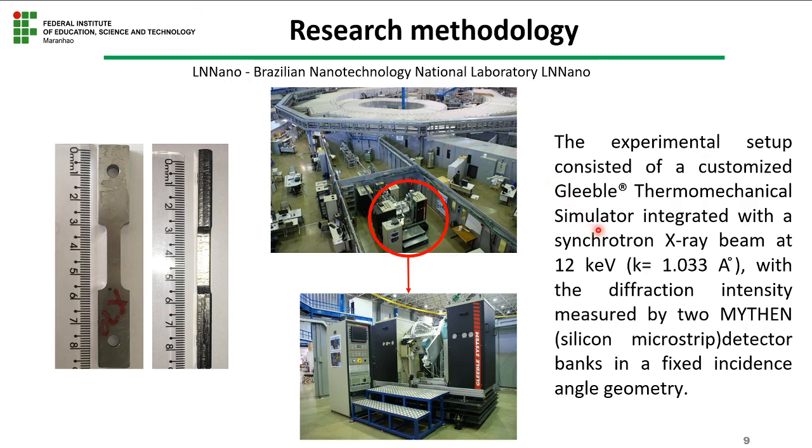This is the synchrotron line that provides the X-ray diffraction beams, coupled with the experiment. The region measured followed the deformation of the sample, and 3 measurements per second were taken during the deformation.